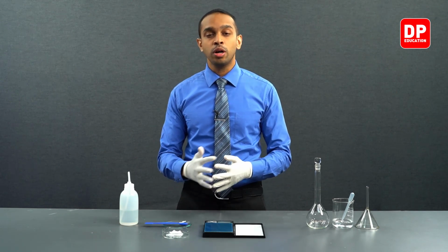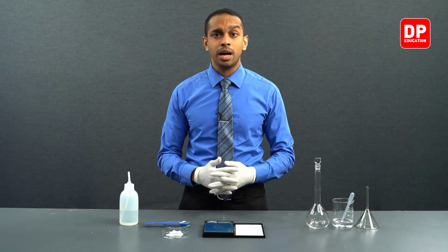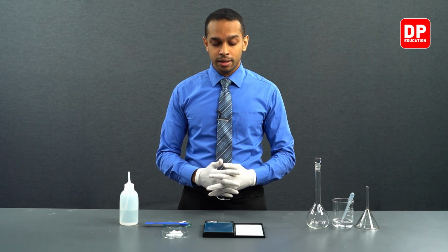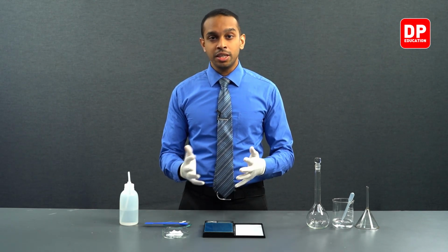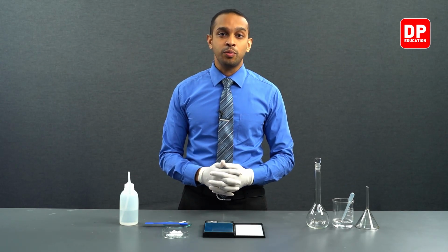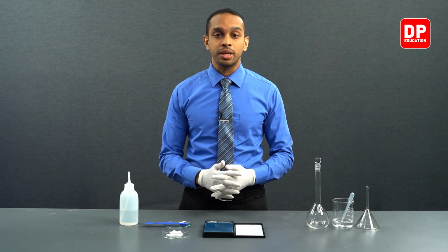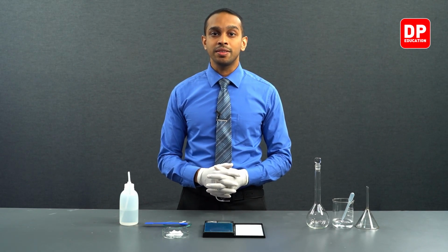So, we will move on to other substances like potassium oxalate over here, which has a high purity, is a very stable compound, has a very good equivalent mass, is relatively cheap, and we can find it with relative ease. So, we will be using potassium oxalate as a primary standard in this practical.